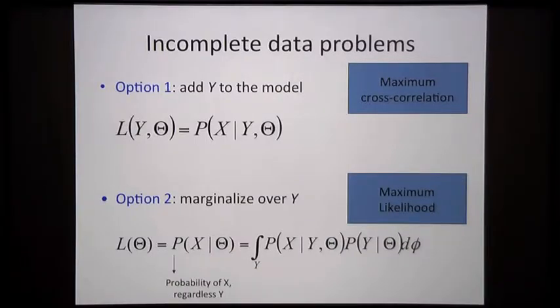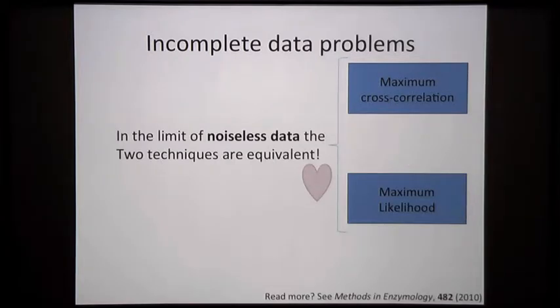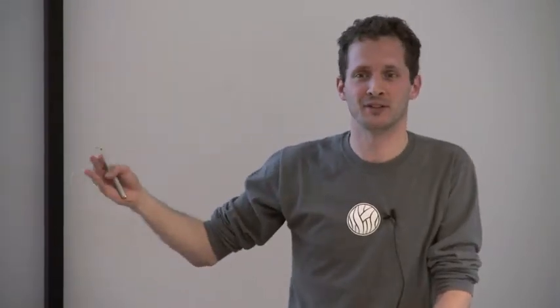Okay, so does that then mean that these two methods are very, very different, or are they at war with each other? No, because as you've seen, the square difference term goes into both of them. Okay, there's the exponentiation of the square difference term divided by 2 sigma squared, minus. Okay, that means that if sigma squared becomes 0, the two techniques actually become exactly the same.